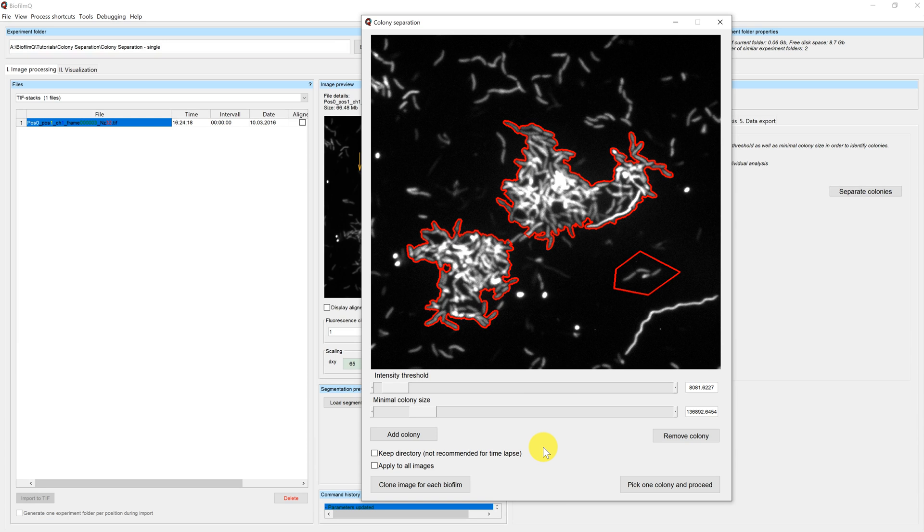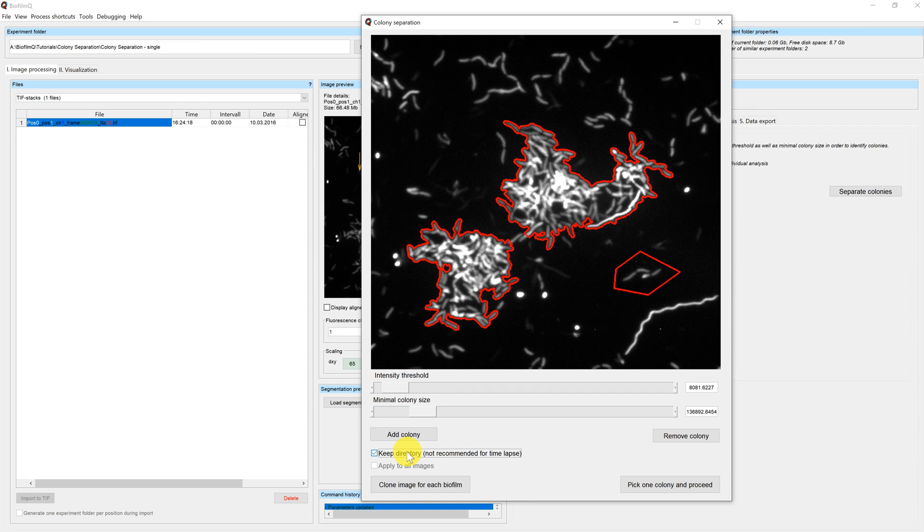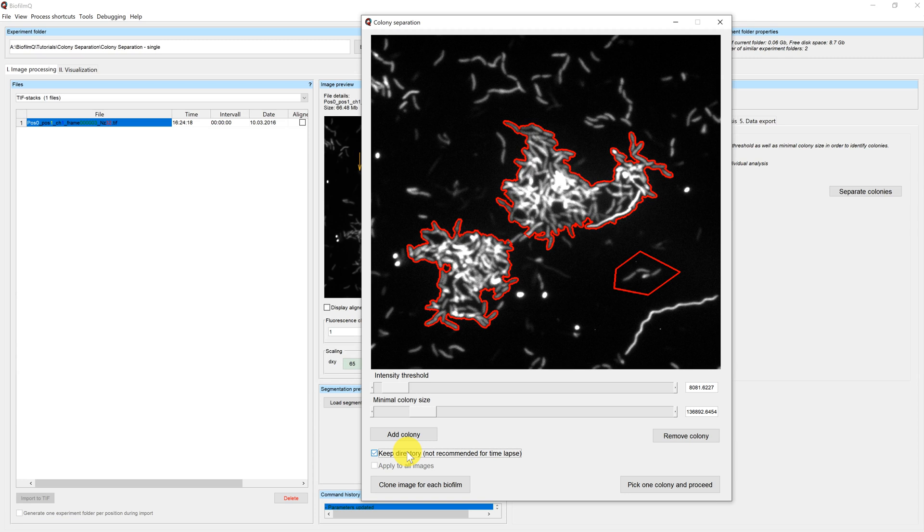By default, the colony separator will create new directories for each microcolony in the selection. You can modify this behavior by using the keep directory checkbox below the buttons. This is only recommended for single images or if you have multiple images of a single time point. A time-lapse analysis is not possible anymore when you have different positions from the same time point in the same folder.